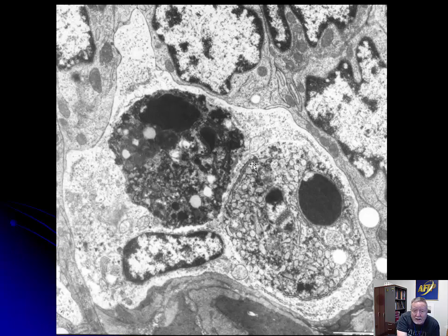There's a lot of endoplasmic reticulum. And this one has been partially digested. Everything's starting to condense. Everything's starting to lose its integrity and turn black, and it really sucks up the osmium on this. So it probably ate this one a little bit before it ate this one. So that's apoptosis. And that brings us to the end of this particular lecture on cellular degeneration.